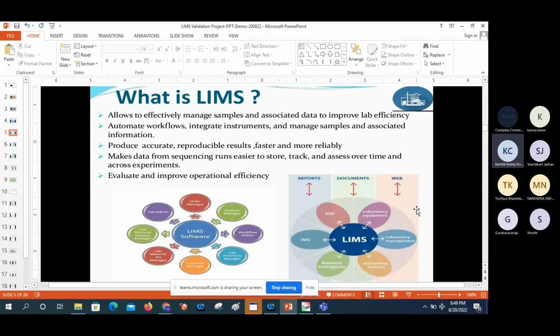Unless the complete life cycle is done, from lot creation to lot disposition, the COA should not be generated. There is restricted content in LIMS. Like this, we need to do proper validation while performing the CSV activities in the specific environments, like the quality environment as well as the production environment.